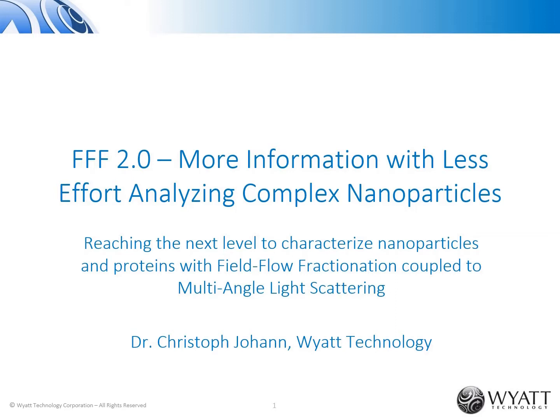FFF has been around for a long time, and I'm sure most of you have heard of FFF or even have experience using it. There's a growing acceptance of FFF, and for example, this has motivated ISO to publish a new standard with the title Nanotechnologies: Analysis of Nano-Objects Using Asymmetrical Flow and Centrifugal Field Flow Fractionation. That is a big step forward to making FFF an accepted and standardized method comparable to SEC.